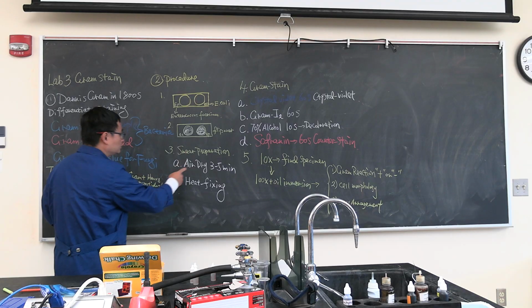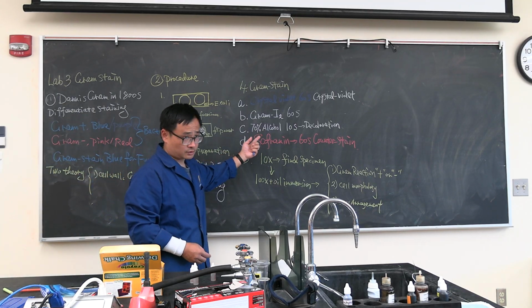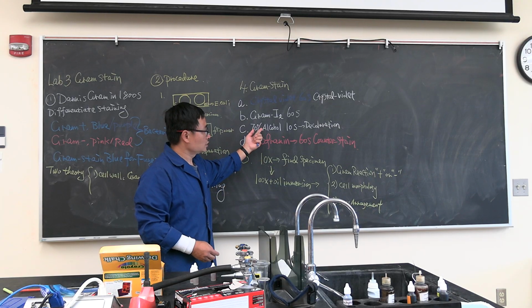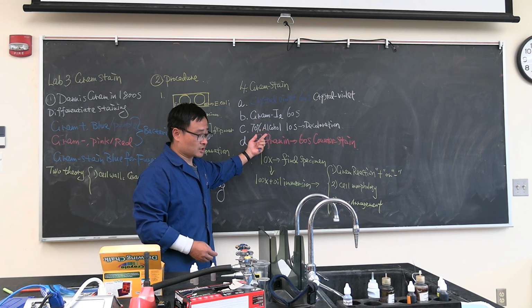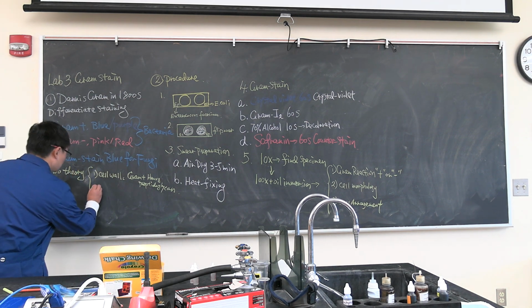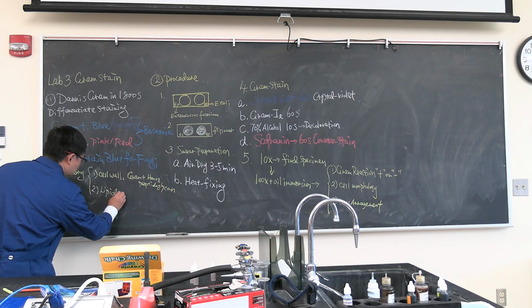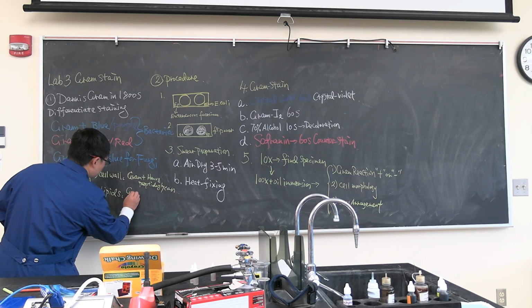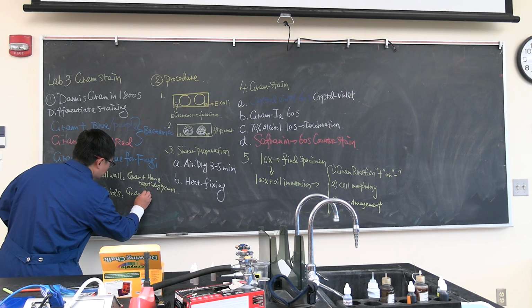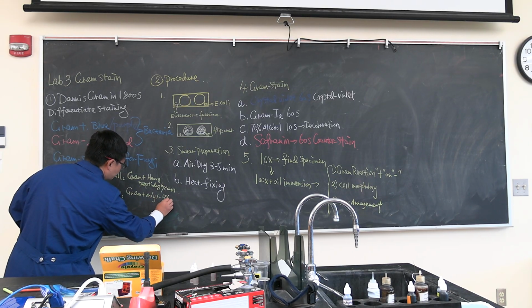So they can hold on to the crystal violet color during the decoloration process. That's why the staining stays there as purple crystal violet. The second theory we call the lipid theory. What this story talks about is that gram-positive bacteria have only 1 to 5% of lipids.